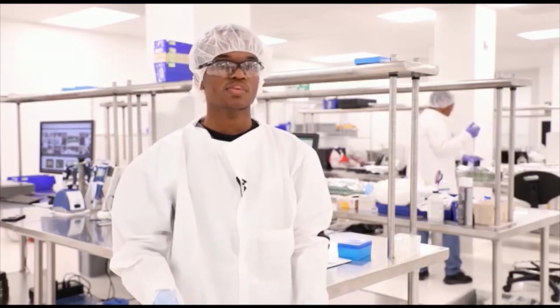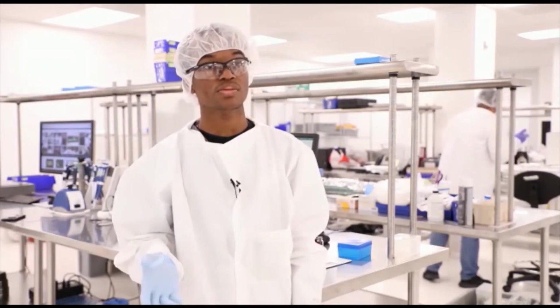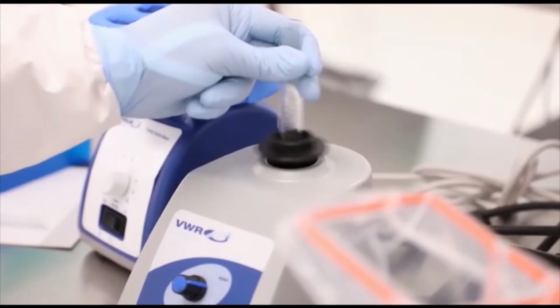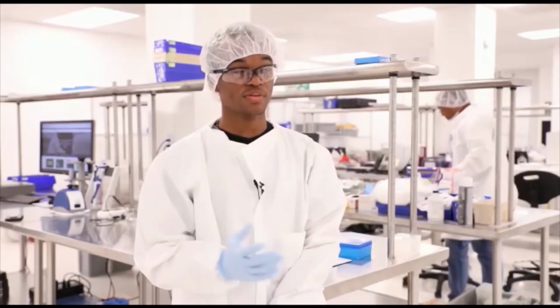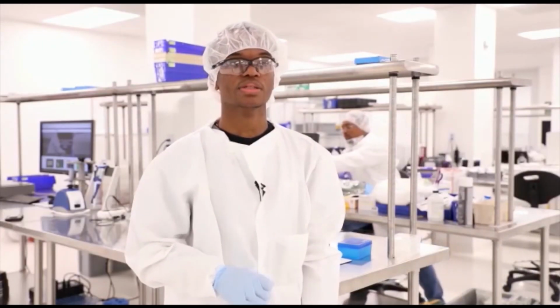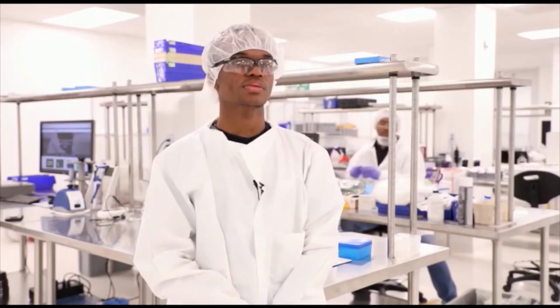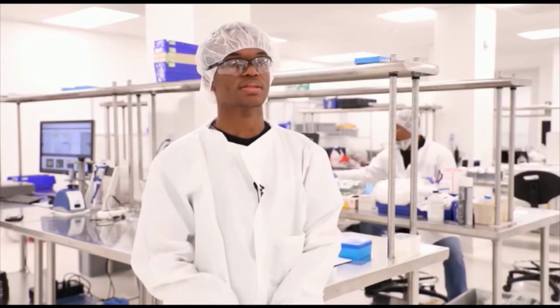With that, we can detect up to 0.001 EU per mL, making the test very specific and sensitive. We use the average patient body weight and max dosage per hour to calculate the endotoxin limit allowed for a sample, and this is how we determine if it passes or fails.